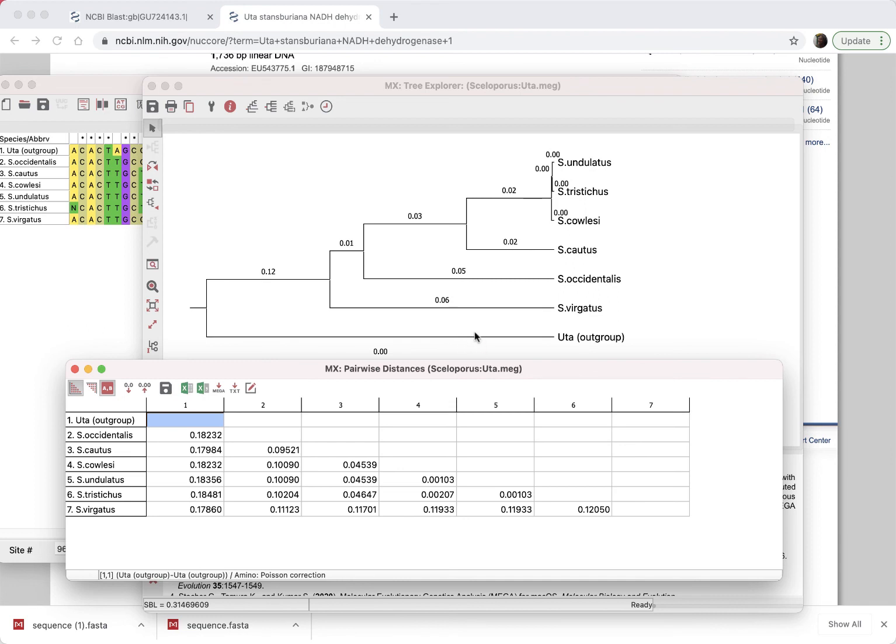These numbers shown in the branch lengths are not highly precise. Rounding error could account for the differences that are there. And it's also not going to be exact, even if we made these numbers more precise. They're not going to add up perfectly, but there should be a pretty good, strong correspondence between the branch lengths that we're seeing in the cladogram and the genetic distances that we're seeing in the genetic distance matrix. All right.